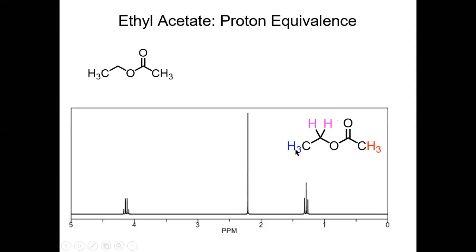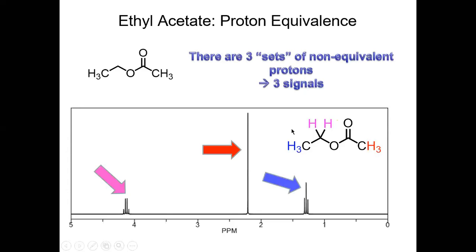And then the blue hydrogens, there are 3 hydrogens on this carbon. They're all equivalent to each other, so they're not going to show up under different signals. They'll all be under the same signal. Yes or no? Yeah. All right.